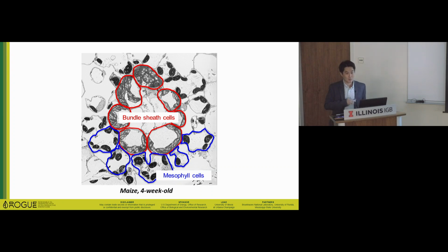But the main purpose of this system is trying to understand the chloroplast and cell wall of sugarcane, and based on this information we got some plasmodesmata information. So the next step is to invest more time and energy in this data file. And also we can target the plasmodesmata, modifying the gene for future research. That's our goal in Don's lab. That's what I can say in this presentation.